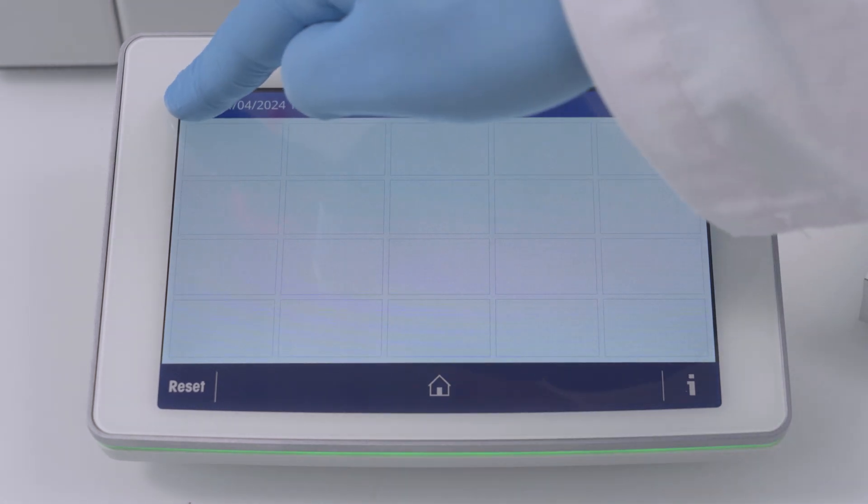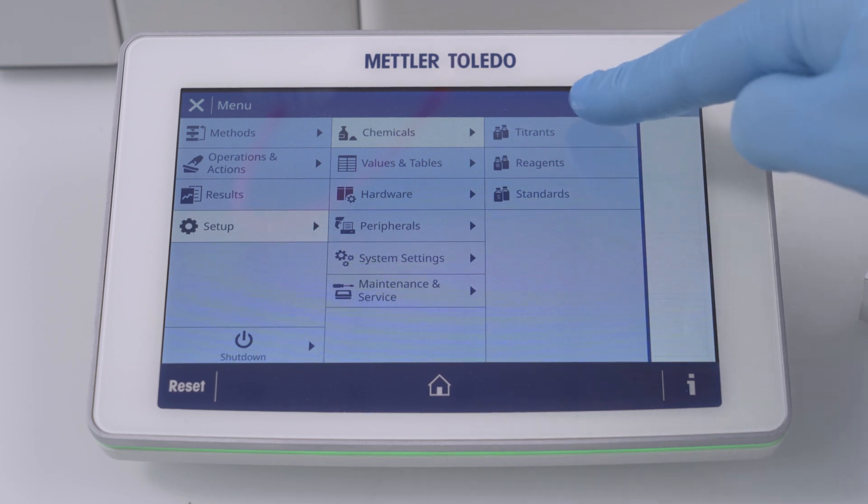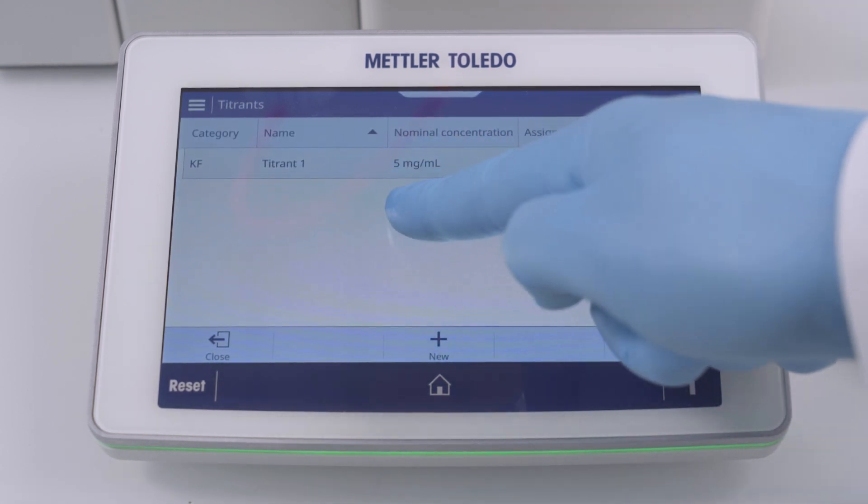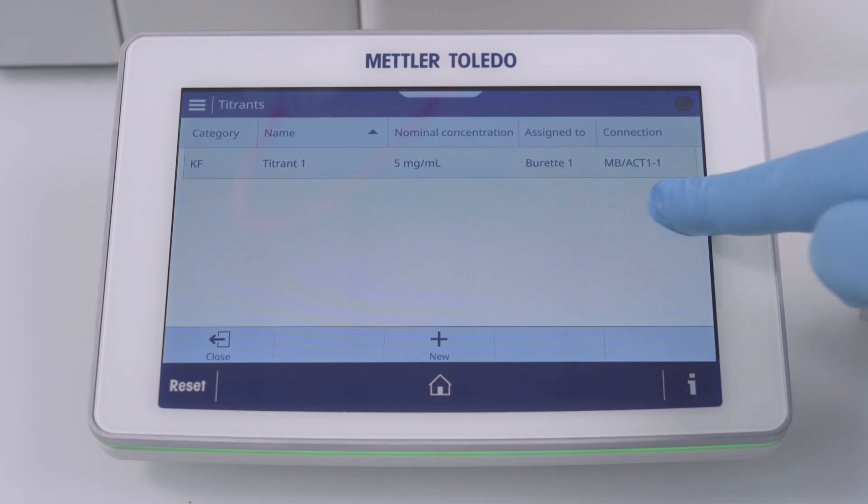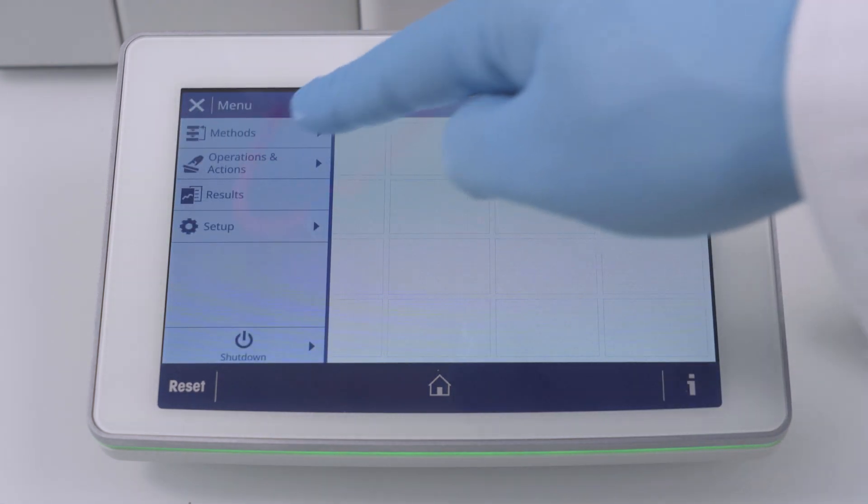It's good practice to also check the entries of the automatically identified resources. Check if the nominal concentration of the titrant is correct and if the type and name of the connected sensor match the physically connected one. The connection fields show to which socket of the boards the resource is connected to and indicates that the communication is working correctly.